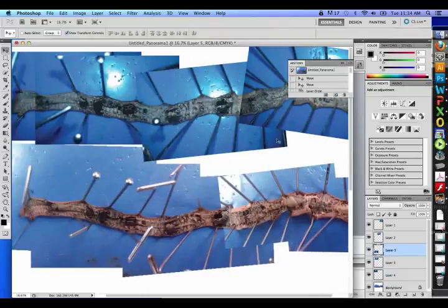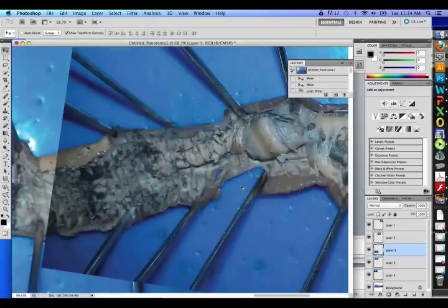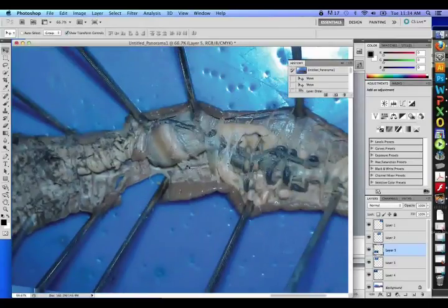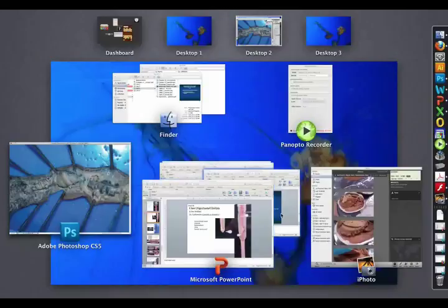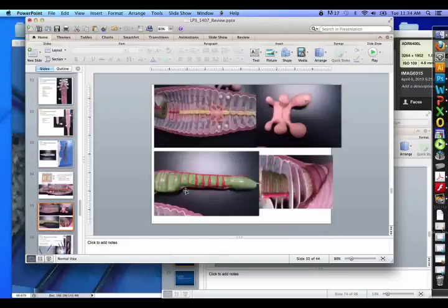I also noticed we could see a nice ventral blood vessel because they have both in this dissection. So look at that. That's the ventral, the dark one, the ventral blood vessel, and that's the nerve cord, the light one underneath. And you could see that on our plastic model too. You'll see there's blood vessels on both sides. And there's the arches.